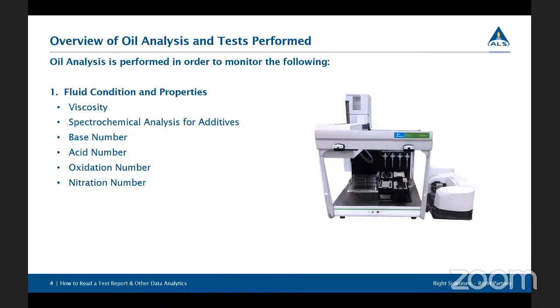So when they're in an environment with heat and oxygen that can get mixed in, that fluid will begin to oxidize. And we have a way, and it's actually the instrument that's there on the screen, which is an FTIR, and it uses infrared radiation that passes through the sample, and we measure the absorbance of different components. So we look at the molecular composition and structure, and so we can see those oxidation structures as they start to grow inside the fluid, and we use that instrument to look at that. Nitration is something that can be tested for. That's most common in natural gas engines.